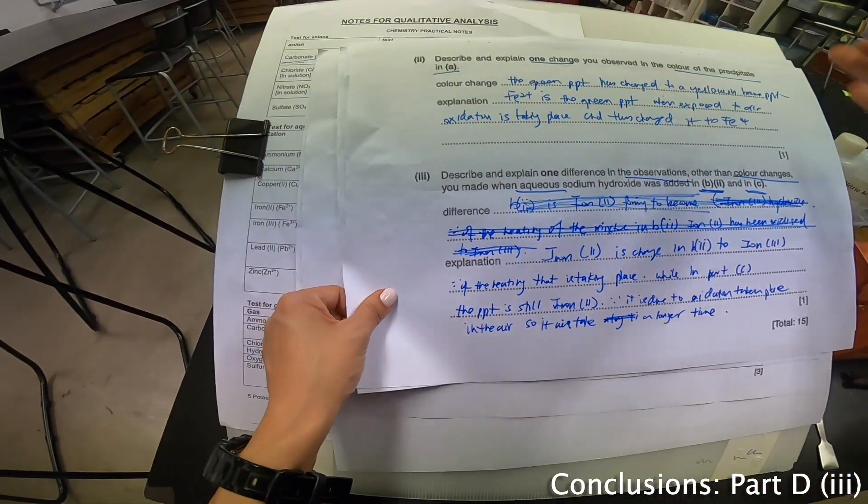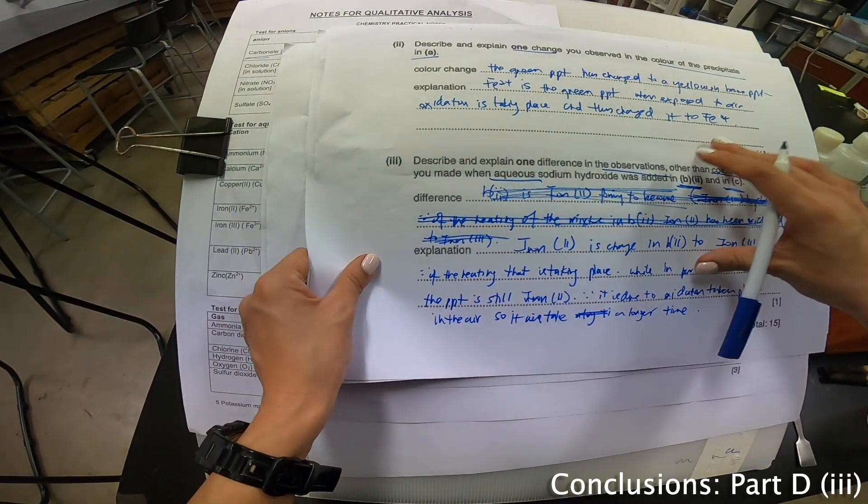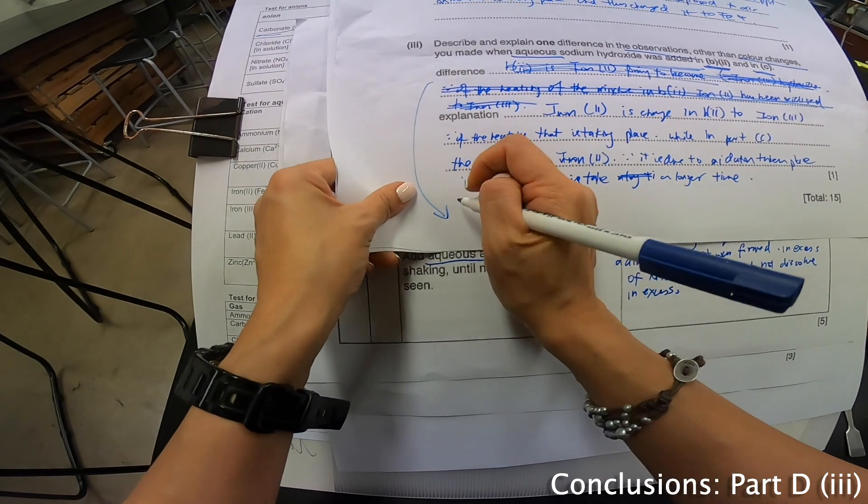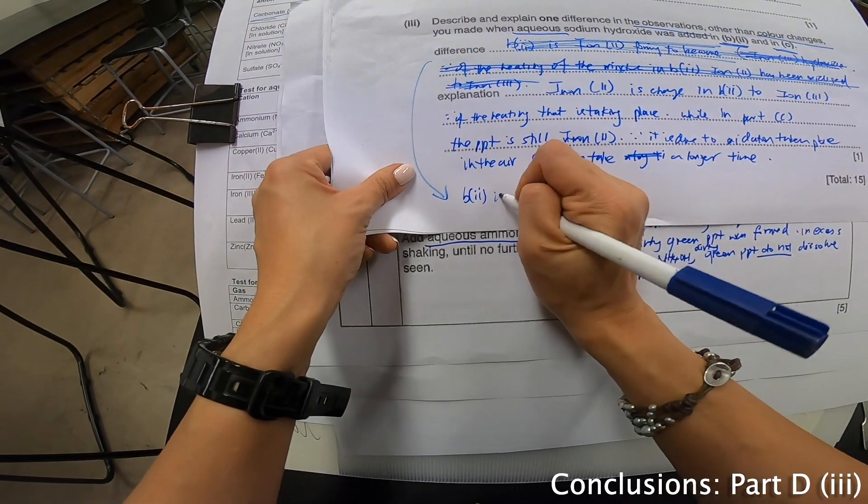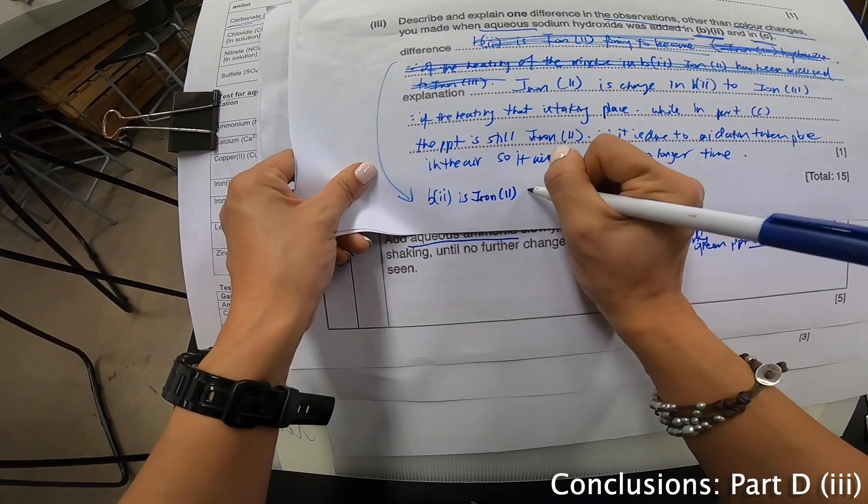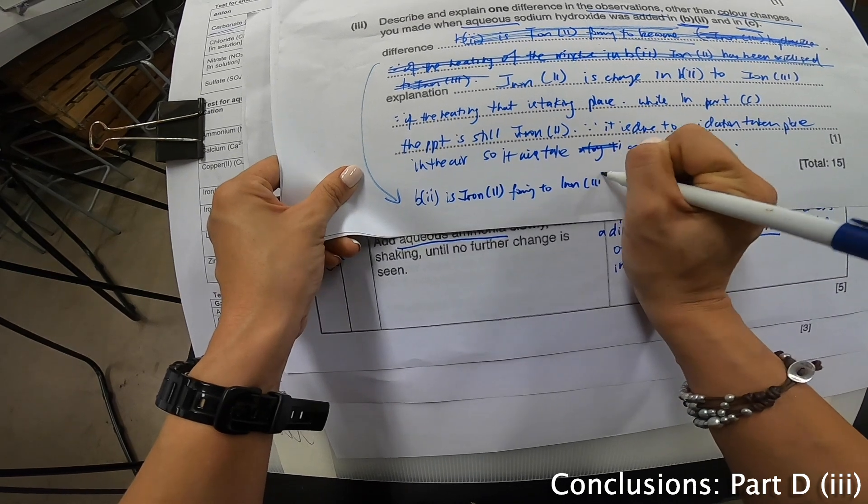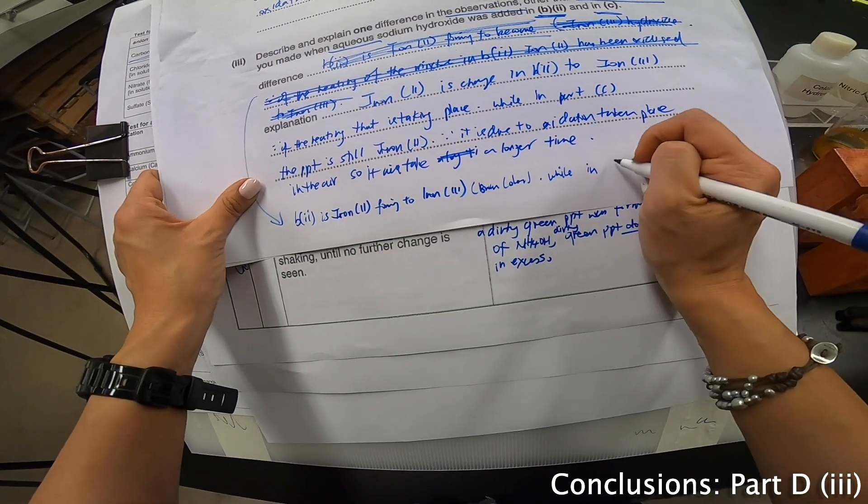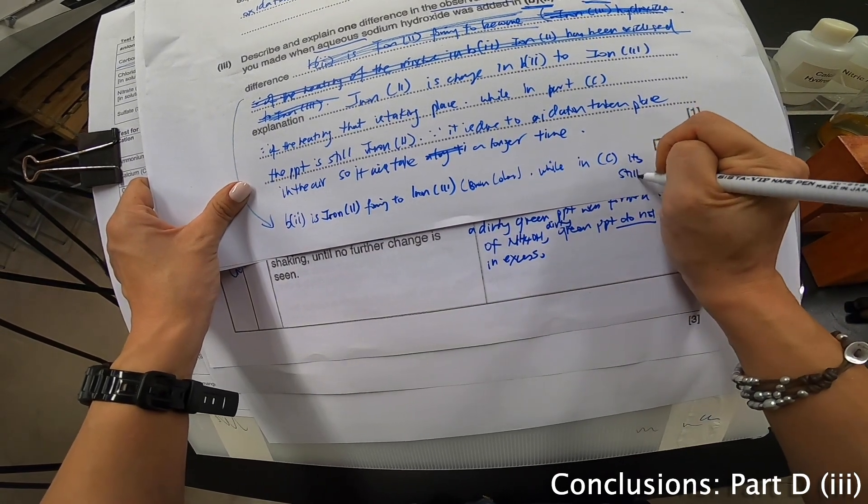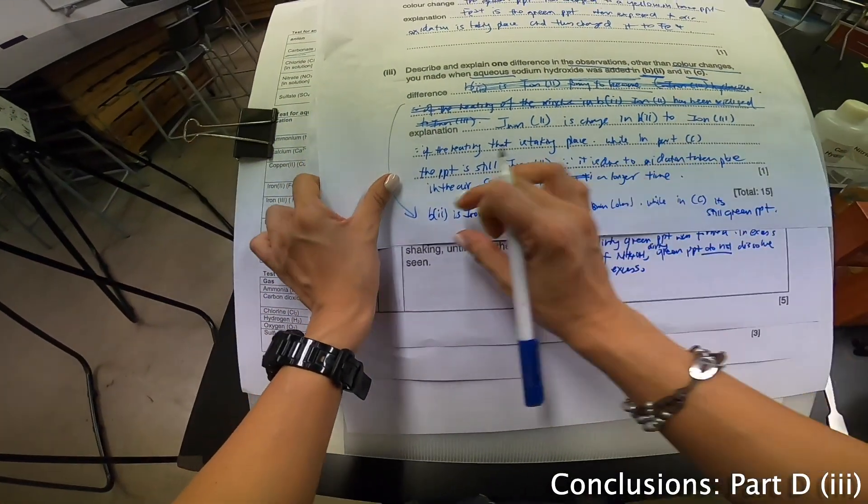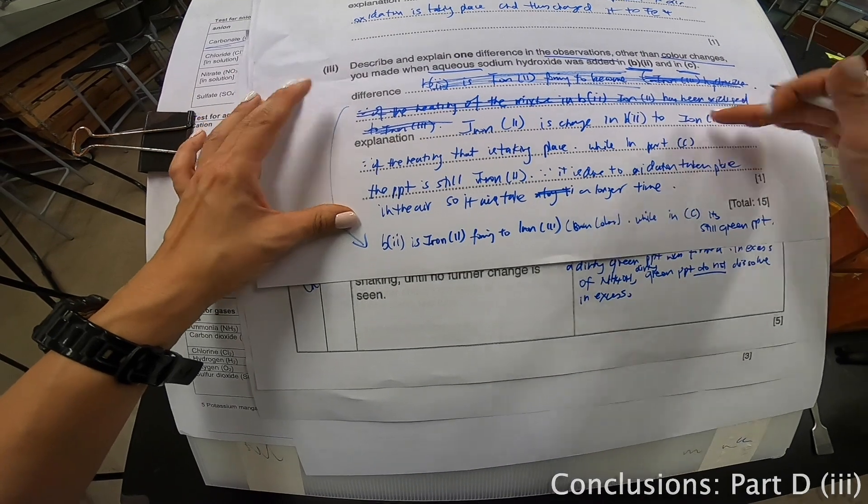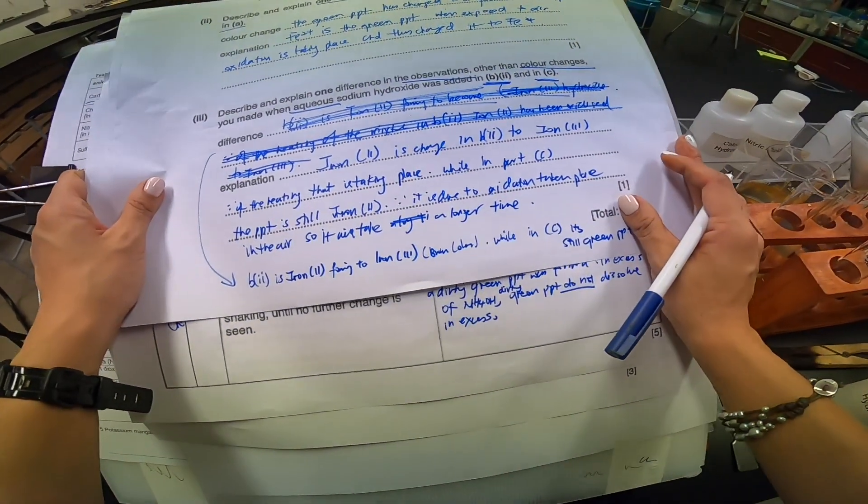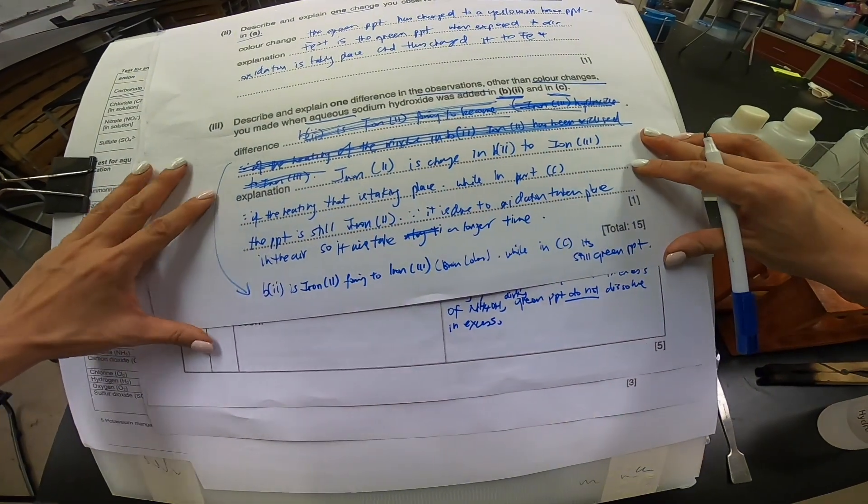I'm not going to redo this video because I want to show that there's a chance that you will make such a mistake like me in exam. So, if it's an exam, I will do this. I will draw a line and write down over at this part B part 2 is iron 2 forming to iron 3 plus the brown color while in C, it's still a green PPT. So, this is the part, the difference. The explanation is here. So, in exam, I know that it looks a little bit messy and untidy but because time is running up, I want to show you that it's possible to finish within this timing.